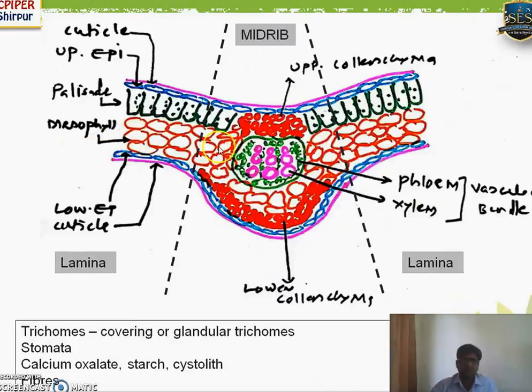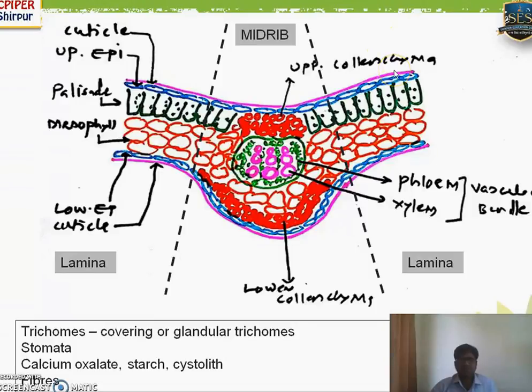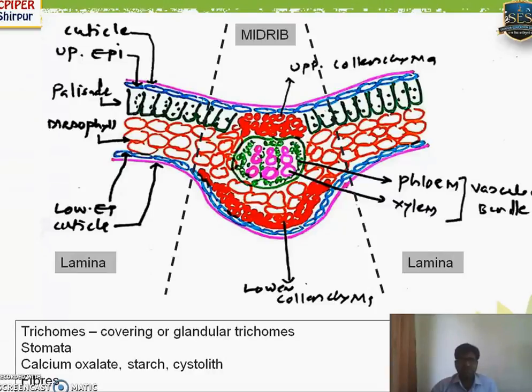Now we are going to see the microscopy. Before studying the actual microscopy, we need to study the general transverse section (TS) of a leaf. The general TS of a leaf can be studied in two parts: the midrib part, where the main vein runs, and the lamina part. This is a transverse section passing through the midrib. In the lamina part you will find different parts, and these are general to most leaves irrespective of the specific example.